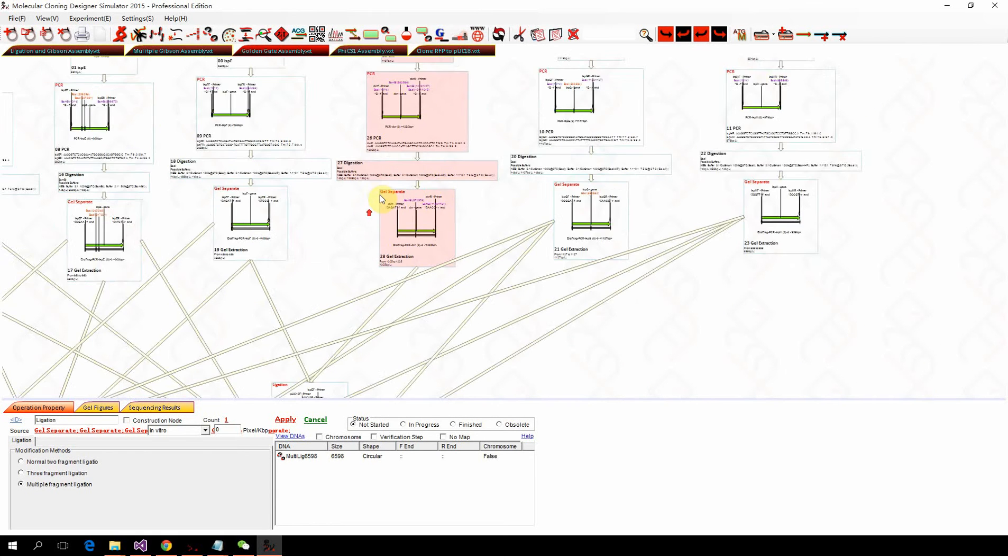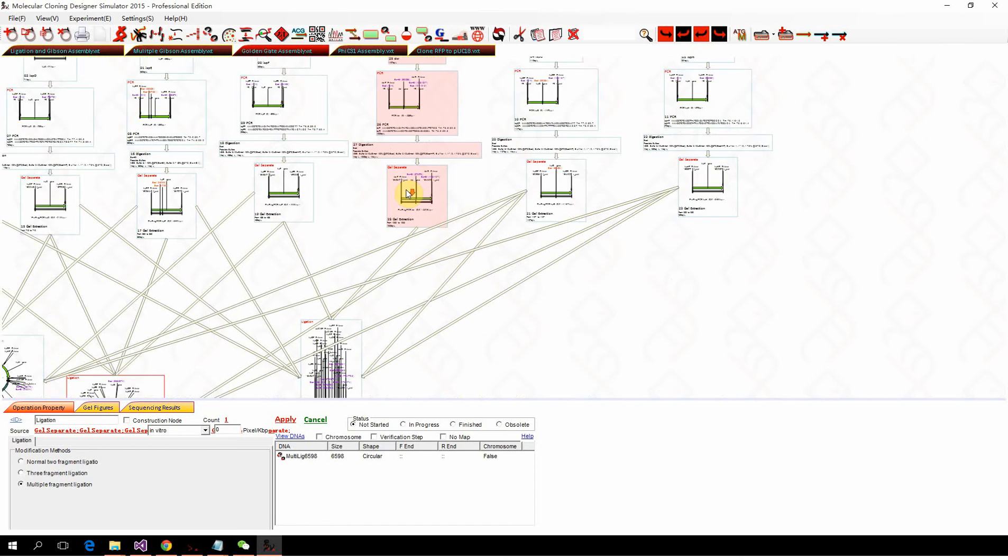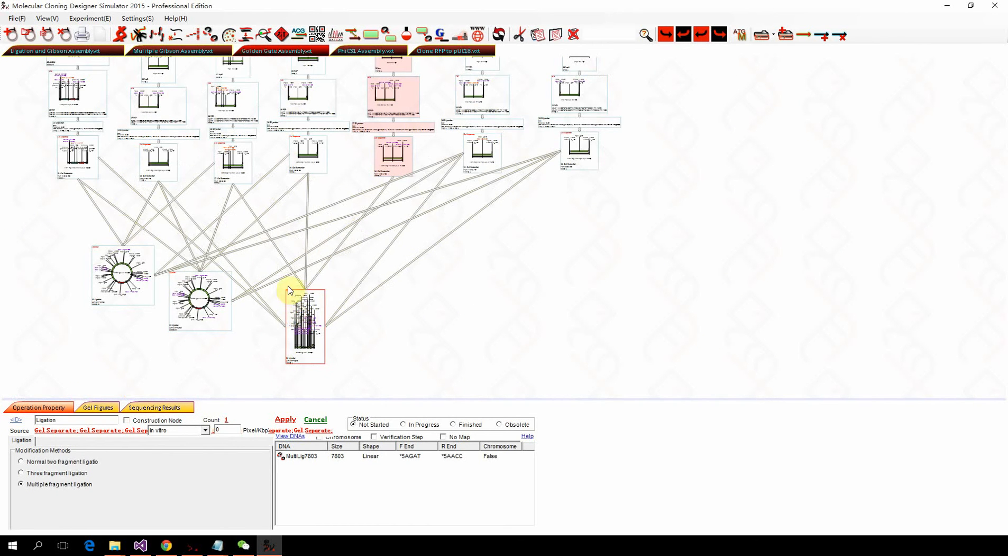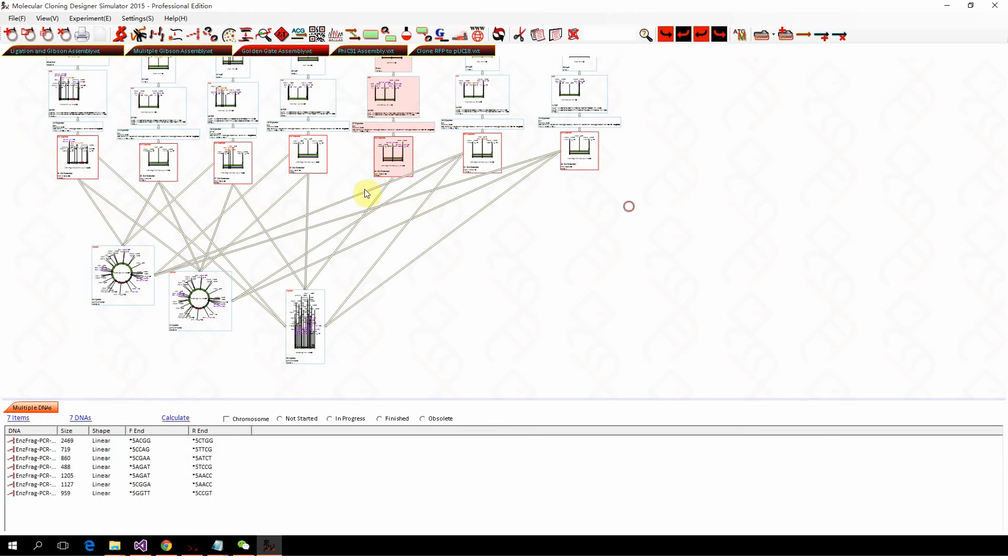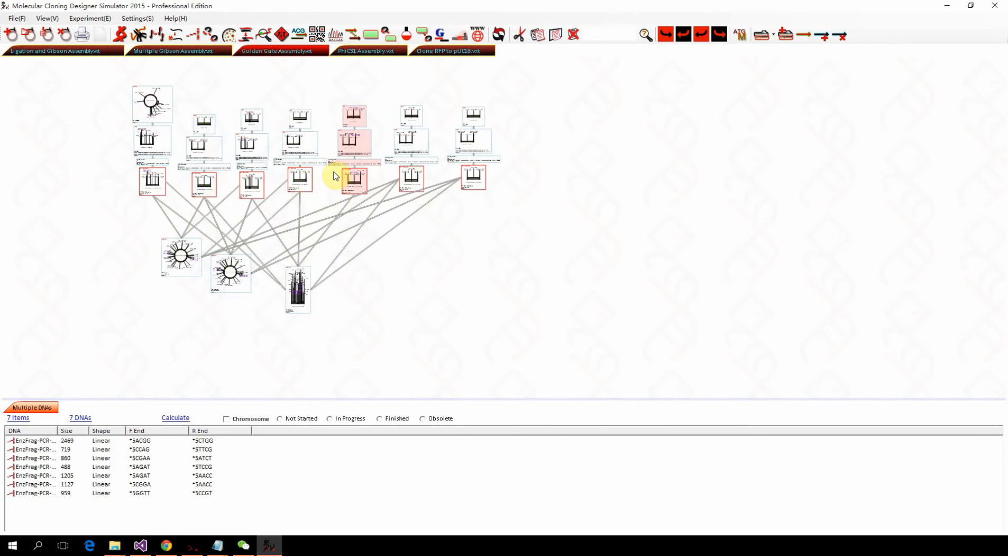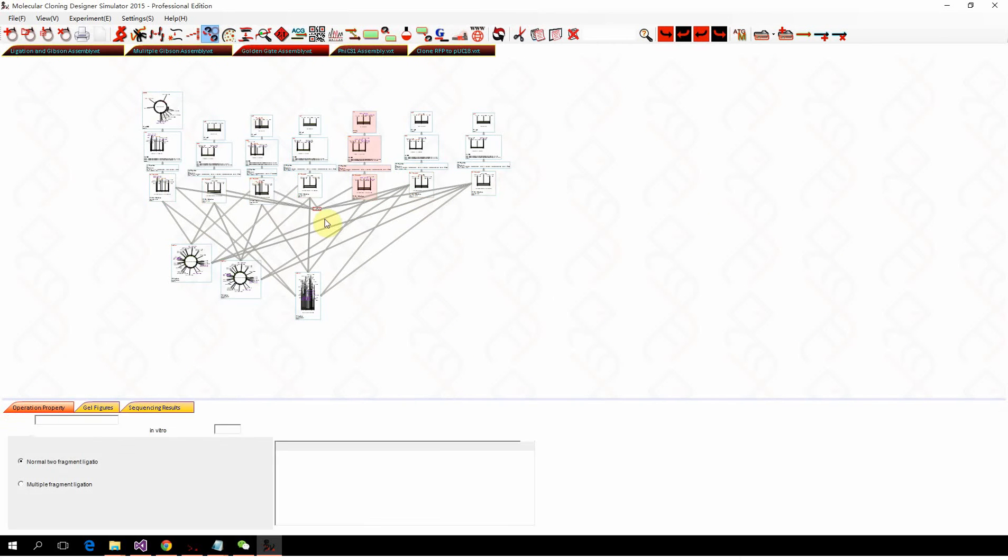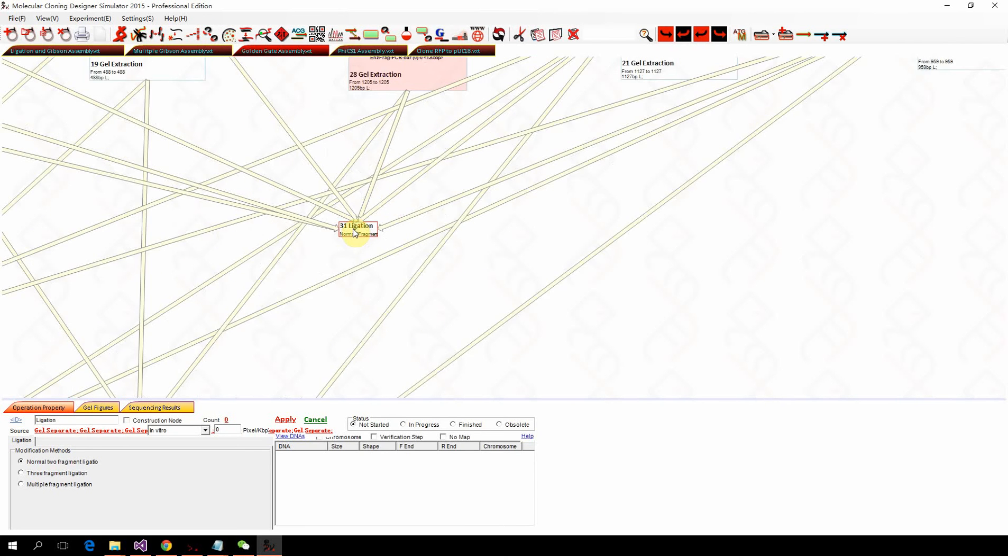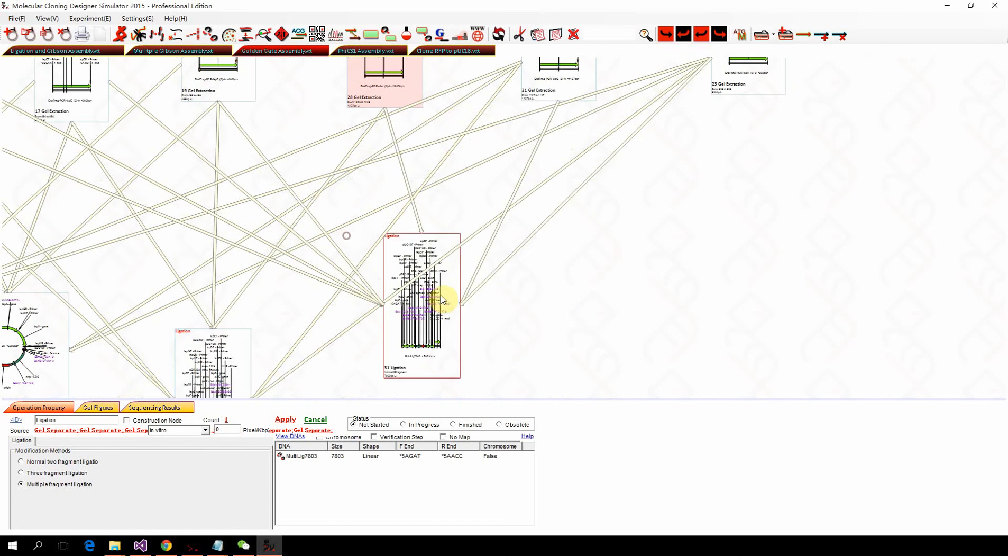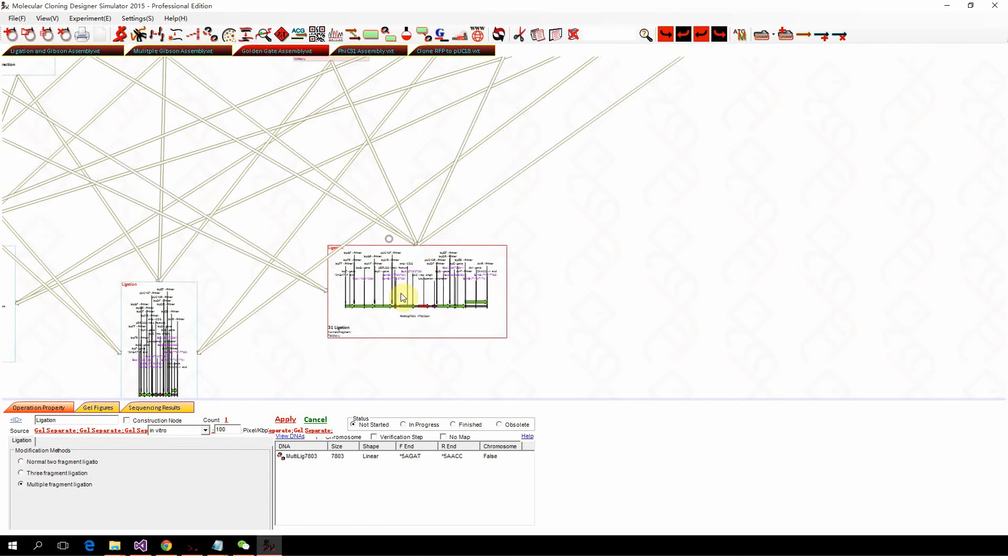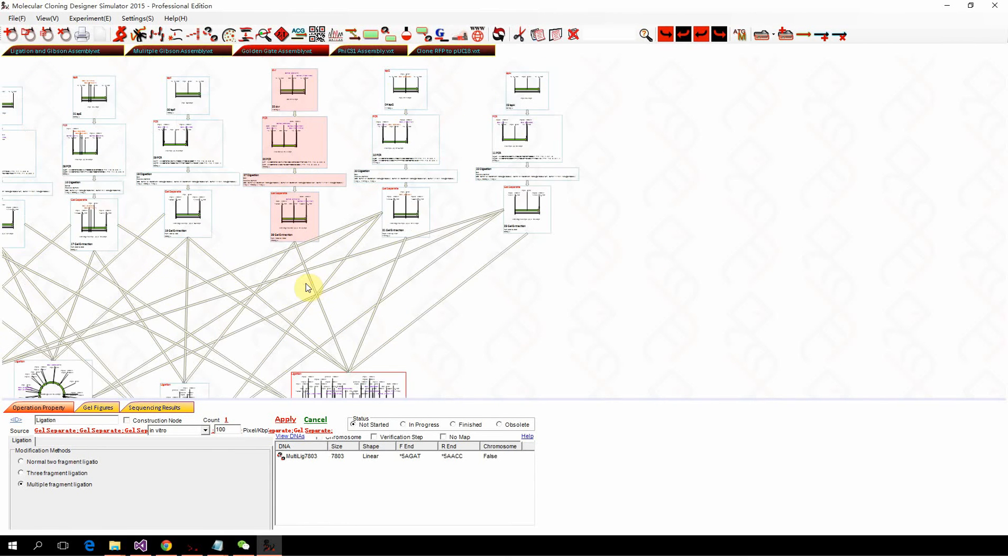However, if we add one extra fragment that doesn't match or work in the system, this is one error we intend to add, so we label it with red. We do the ligation again, we select multiple fragment ligation mode and apply, and here you can see you won't get the circular form because there's some error in your design.